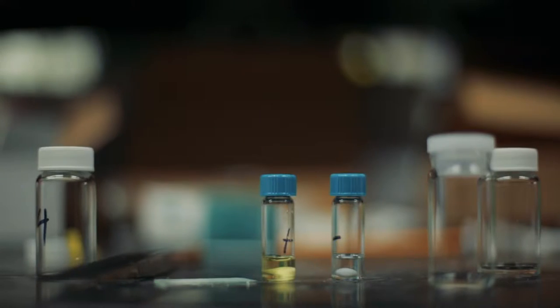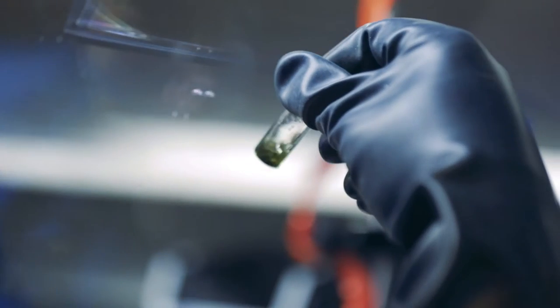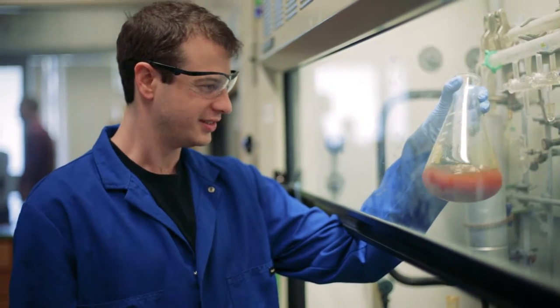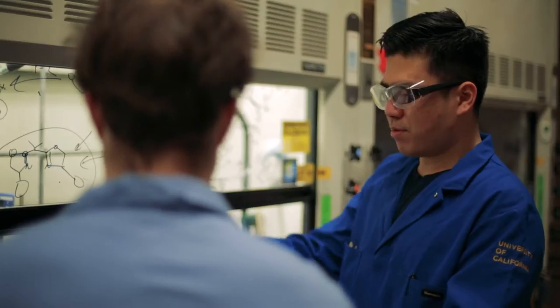A lab coat plays a very important role in laboratory safety. The principal action the lab coat provides is a barrier between the researcher and chemicals, but they don't provide protection against liquid materials. In particular, there's not a great level of splash protection, and also the current lab coats wick chemicals, and that's a hazard to the researchers.